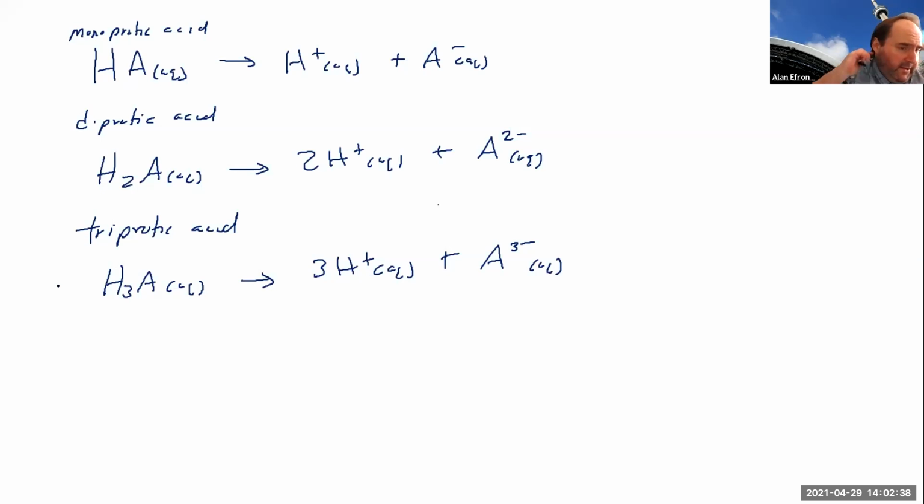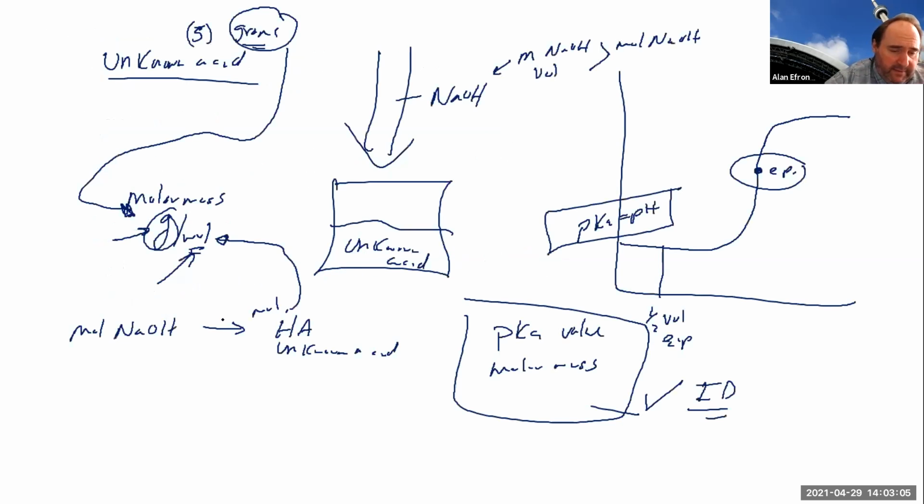I almost think, and I could be wrong, but it should say somewhere, that the unknowns in the software are all monoprotic acids, which means you'll have a 1-to-1 relationship. Remember though, if it says it's diprotic, that is not going to be a 1-to-1 relationship, but a 1-to-2 or 1-to-3 relationship. And what that would affect would be right here.